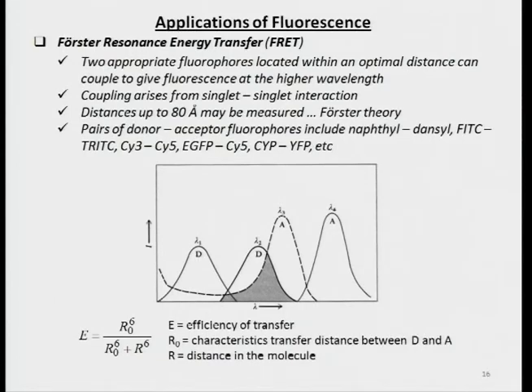And as far as our field is concerned, which is of serpins, a group utilized this in order to find out what the structure is. Not really the detailed atomic structure, but where the different units of the protein are, using this profile by cysteine modification of several fluorophores. We now have several different fluorophores.